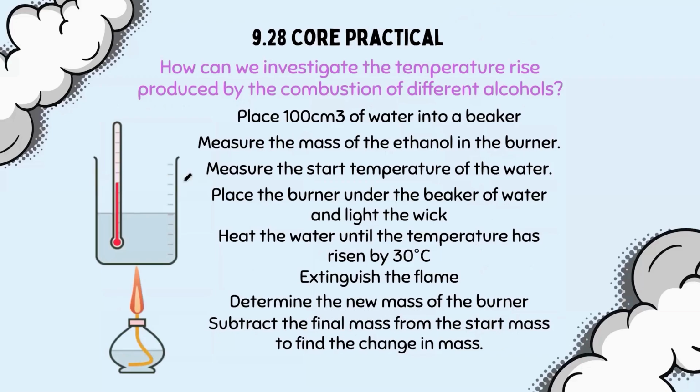Core practical. How can we investigate the temperature rise produced by the combustion of different alcohols? So you place 100 cm³ of water into a beaker, measure the mass of the ethanol in the burner, place the burner under the beaker of water and light the wick.